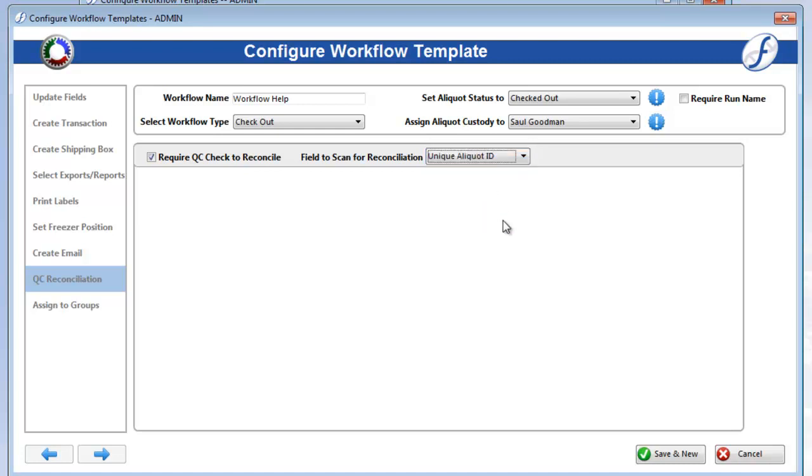If you do not turn on Require QC Check to Reconcile, this page will be called List of Aliquots instead during processing, and simply display the aliquots you have selected in a list view.